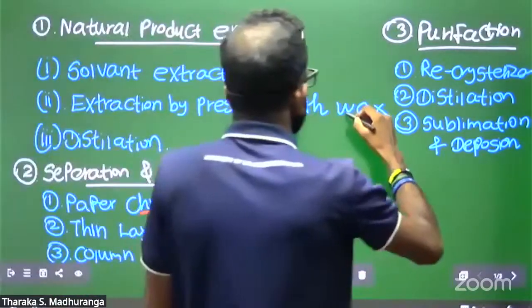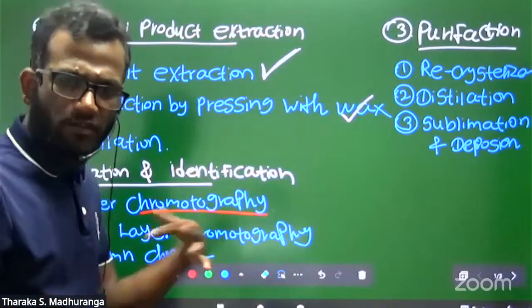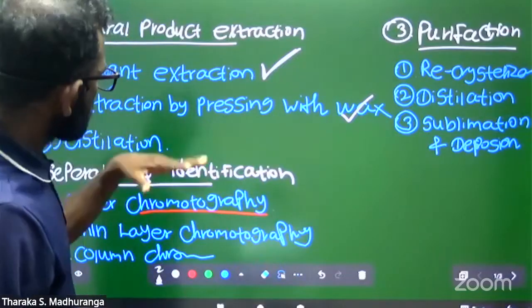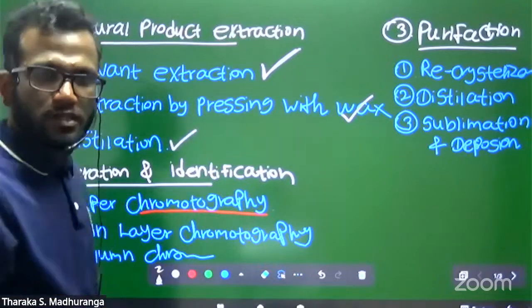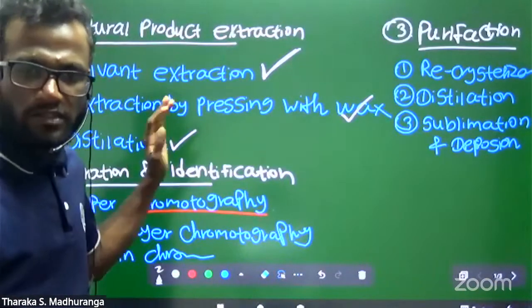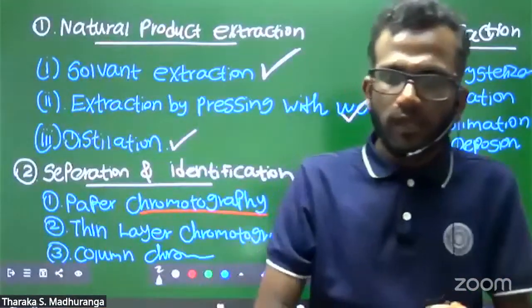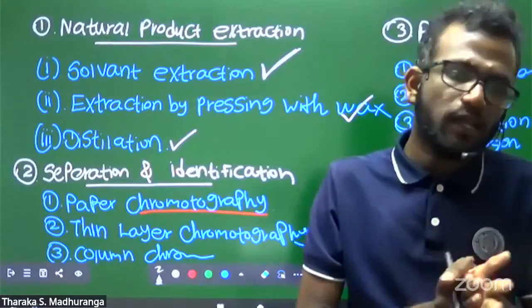The extraction by pressing with wax, I found a video, but I couldn't find a good one. I will try to show you a perfect video for extraction by pressing with wax. Now we discuss distillation and distillation practicals. The pressing with wax, you can understand. That's a simple process. The name also explains the process: pressing with wax and separating the volatile compound.